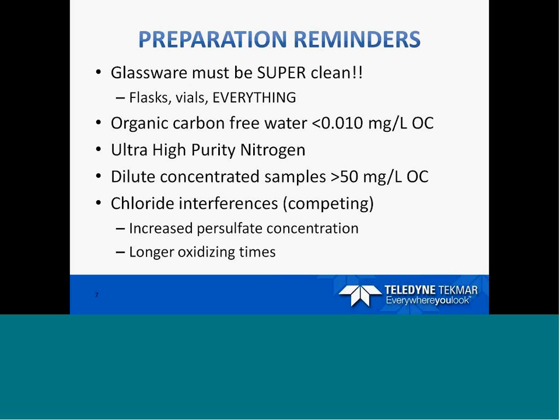But we want to minimize the amount of salt if possible. You can do that several ways. We can do it by dilution, or you can increase the persulfate concentration or extend the oxidation time. And we're going to talk a little bit more about this.